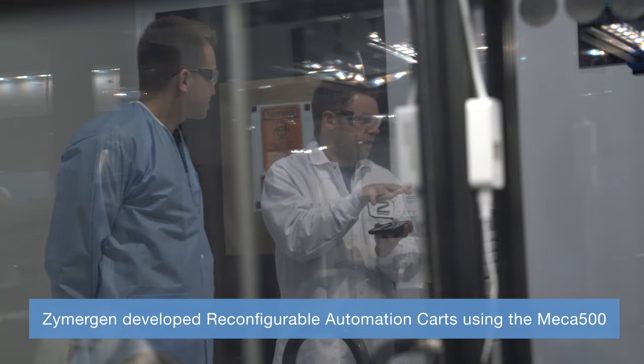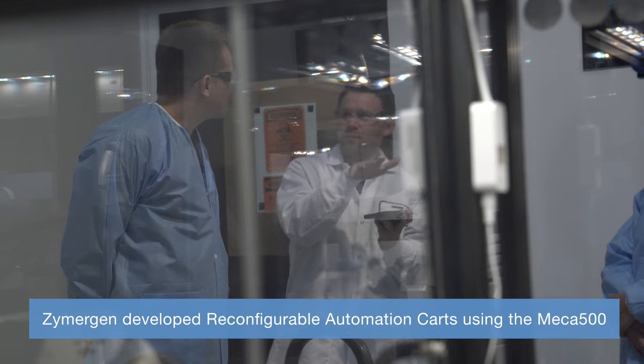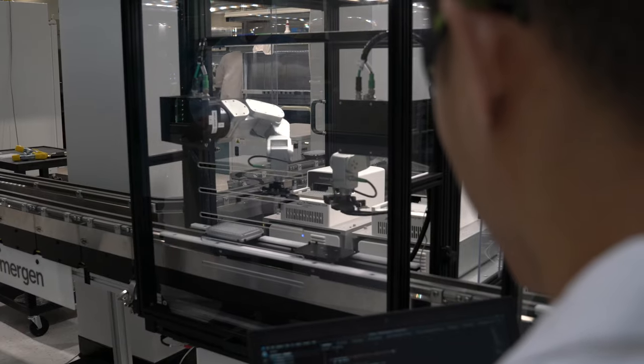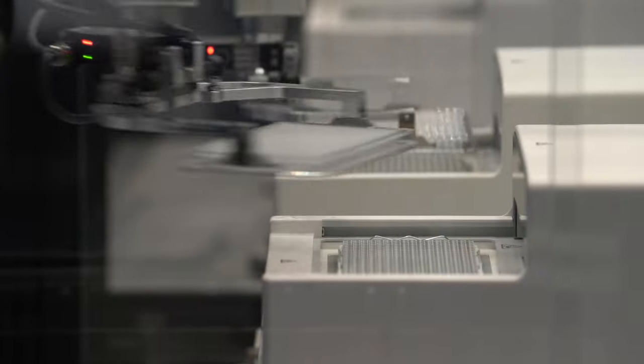So what we've done is we've designed a new system that is more reconfigurable, more modular, and with that it pushed us towards smaller robots that can effectively distribute the throughput payload workload that needs to go on in our system. And we arrived at Mecca 500 because it was a good price, it was very accurate, it really fit the bill for what we're looking for.